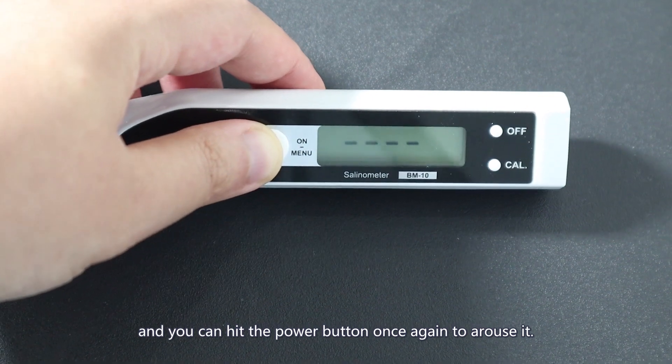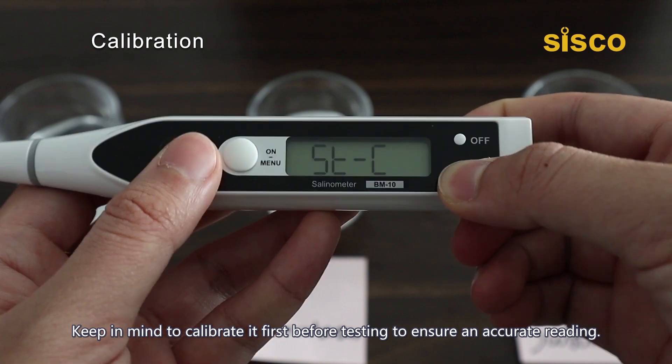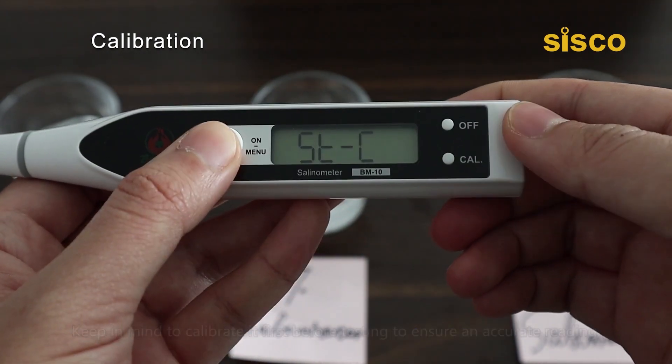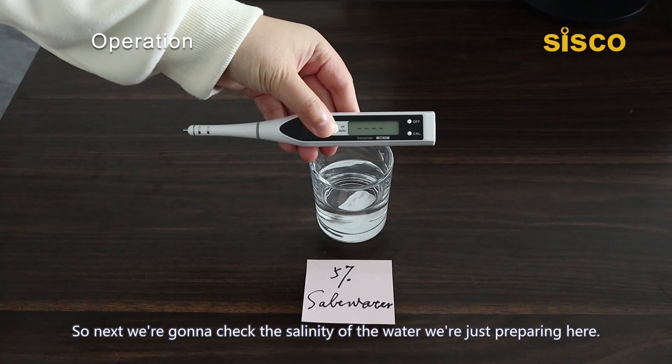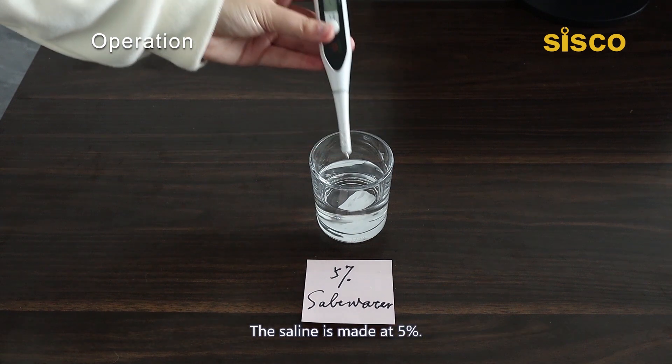You can hit the power button once again to wake it up. Keep in mind to calibrate it first before testing to ensure an accurate reading. Next, we're going to check the salinity of the water we're preparing here — the saline is made at 5%.